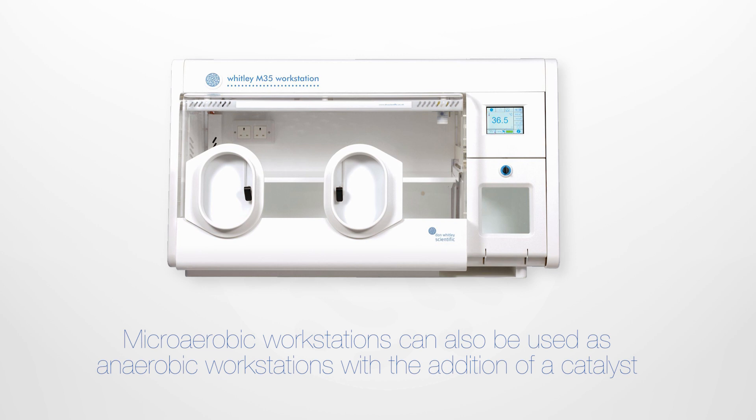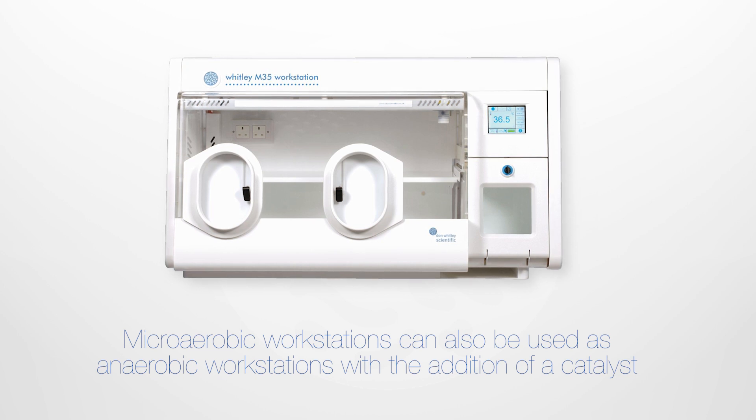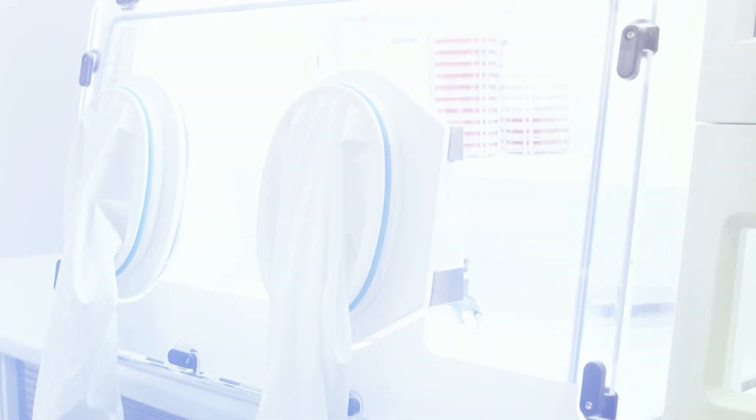Whitley microaerobic workstations incorporate many unique features developed by combining customer feedback with our many years of expertise. We are confident there is a workstation within our range to suit your application.